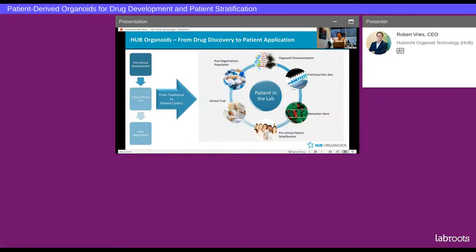So I think this is the point, and that is also summarized here. Taking the organoid technology again, where we stand at the moment, we have shown that for many samples we can generate these disease models that are genetically stable, that from a scientific perspective should indeed represent the patients. And indeed, when we do these comparisons to the clinical results, we see a direct correlation between patients and tumor. At the same time, we can use these samples in a group, in a biobank. So we can not only from a single patient, but in a group, have an idea of what happens to a treatment when we test it in a clinical trial.